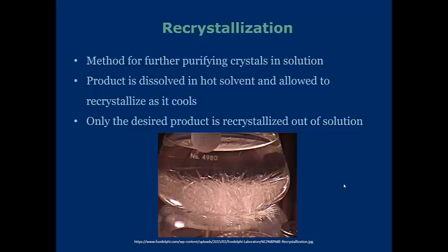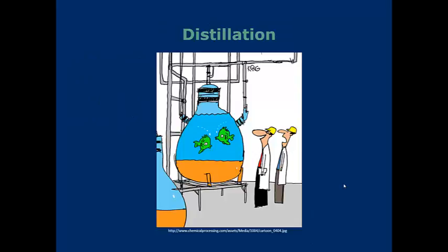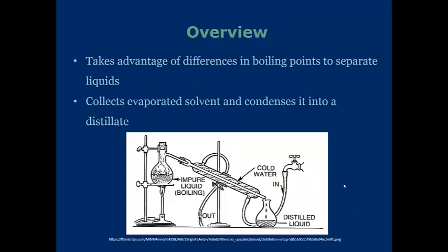At the bottom is an example of this recrystallization. You'll see some very beautiful crystals because of this. If you're curious, this is how crystals form in general. Now that we've talked about solubility-based methods, let's go into distillation. A basic overview of distillation is in order.